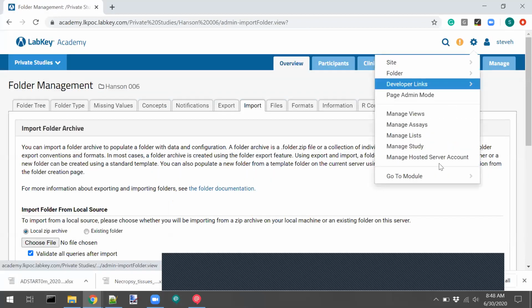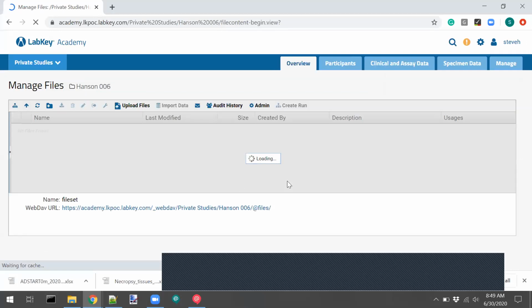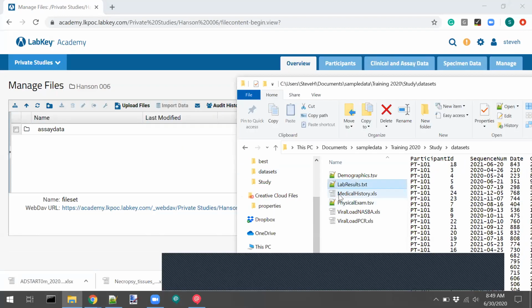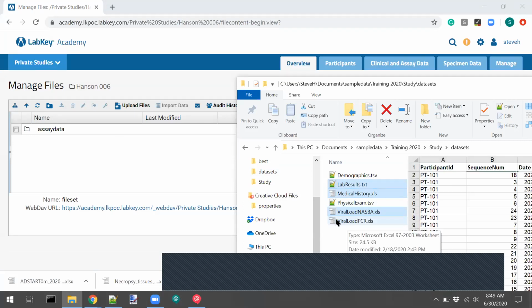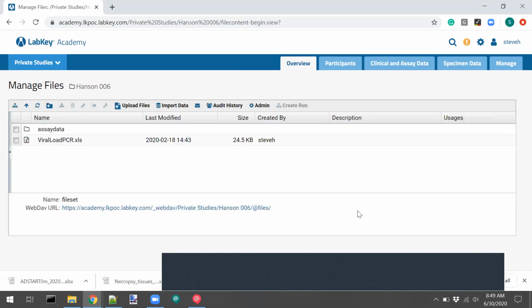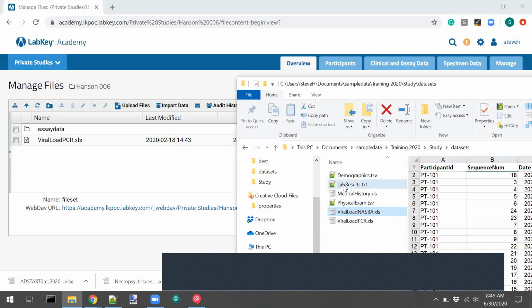Now, there's a little bit of UI I haven't surfaced here called the file browser. If I drag any data into this file browser, LabKey's just going to parse it all and put it in my study. So I have 4 remaining data sets here. And I'm just going to drag them into the file browser. And LabKey, well, I'll do it one by one, I guess, should just do this for me all automatically.